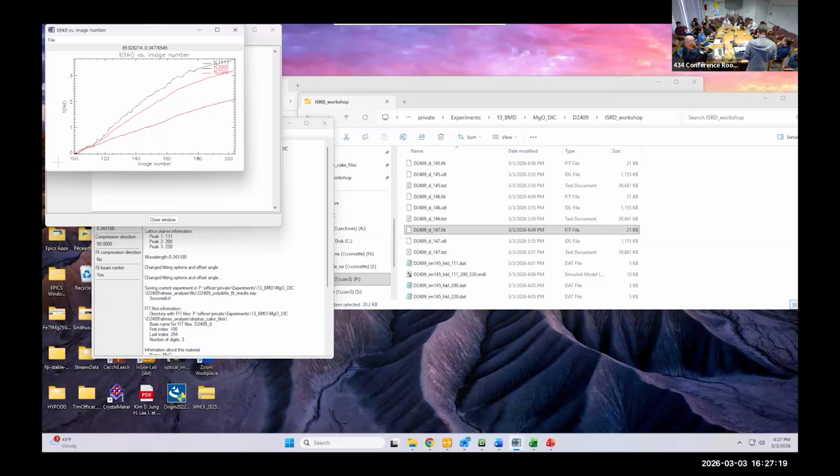So basically, what's determining the peaks is the symmetry of the material. Once the symmetry is fixed, the composition is fixed, that's the peak you get. Yeah. So with minerals with the same symmetry, their d-spacings might be different between different minerals, but the pattern will still be the same if they have the same symmetry, no matter the stress or temperature.